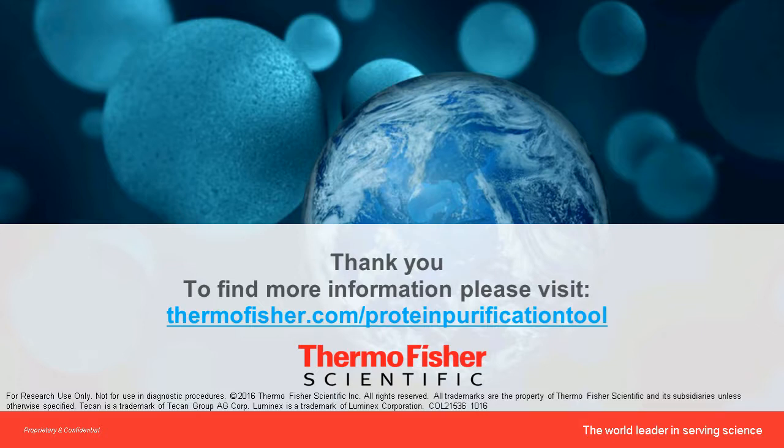The wash buffer we optimized is not a high stringency or a very low stringency; it's somewhere in the middle. So the stronger the interactor, the more likely you will see it in your IP-MS results. But if the interactor has a low binding affinity, it usually gets washed off during the washing step in immunoprecipitation.